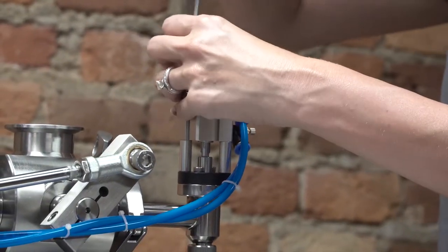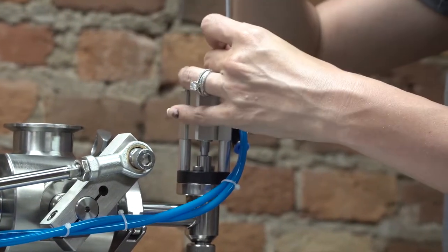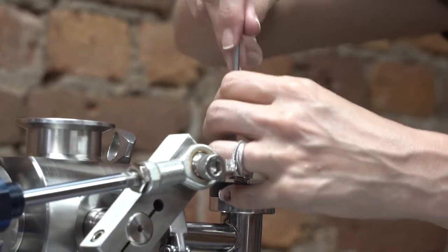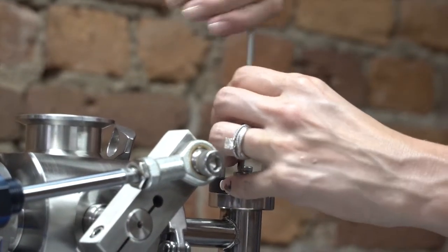Use the 4mm hex key to remove the nozzle air cylinder bolts. You'll also use the 4mm hex key to remove the bolts holding the black nozzle cap.